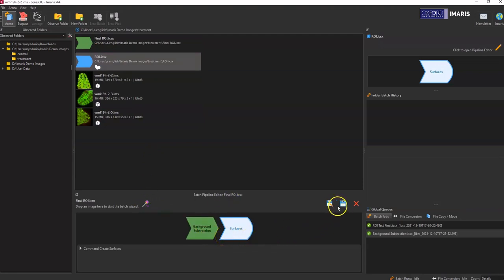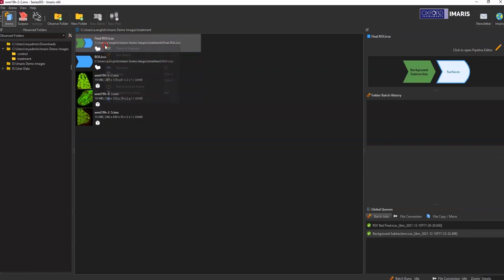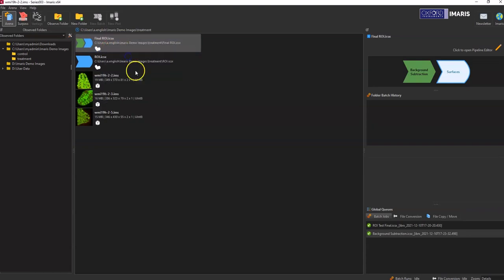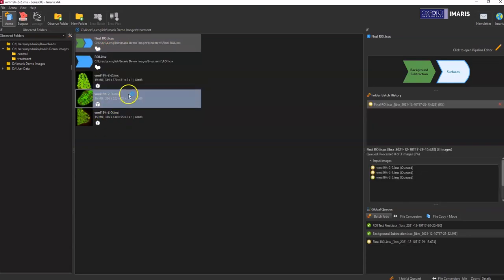And you can either save this as a new batch process or you can just overwrite that original one. But now once you're satisfied with what this batch is going to be, you can then run the batch on any files that you're interested in.